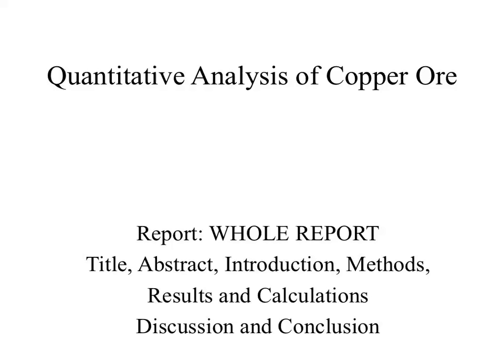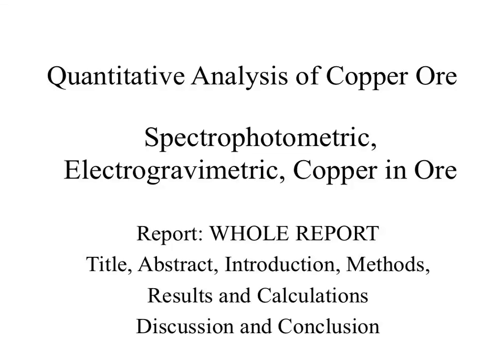Copper ore is probably a really good one to include. After all, that is what you are evaluating in this experiment. And the last really, really big one, the electrogravimetric phrase, which brings in electrolytic. Okay? So we've got those all kind of summarized up there.